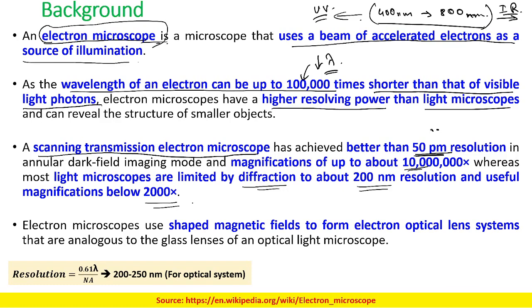In certain things, you will find people claiming that they give you 2500x optical zoom. Don't go for that, because practically it is not feasible. The diffraction of the light would be so high that you will not be able to achieve such high magnification.